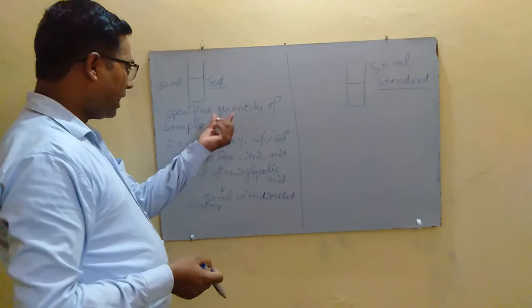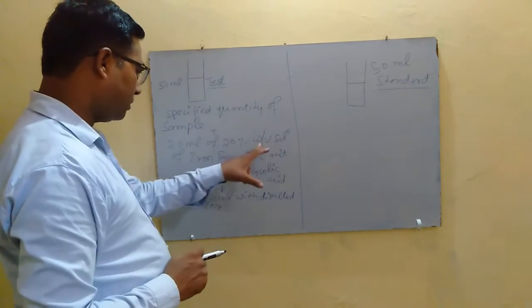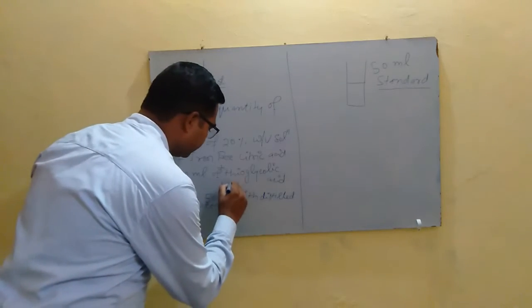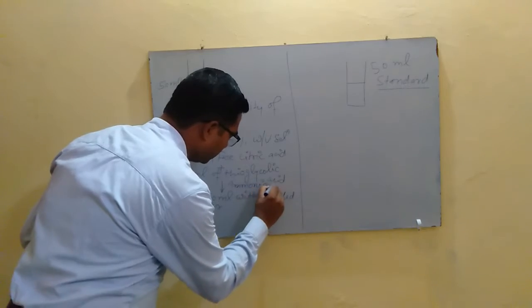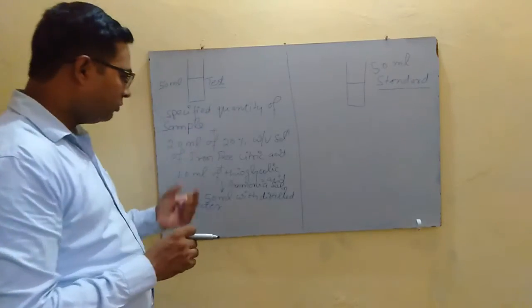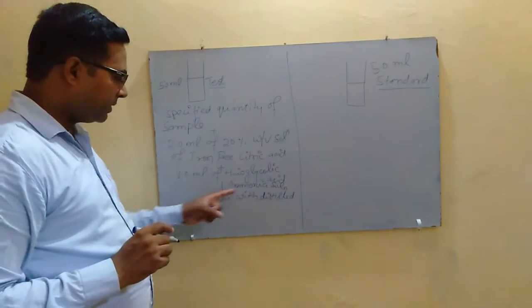The iron present in the test sample reacts with thioglycolic acid in the presence of ammonia solution. Ammonia solution is added in the limit test of iron to maintain the basic environment, and iron reacts with thioglycolic acid in the presence of ammonia.